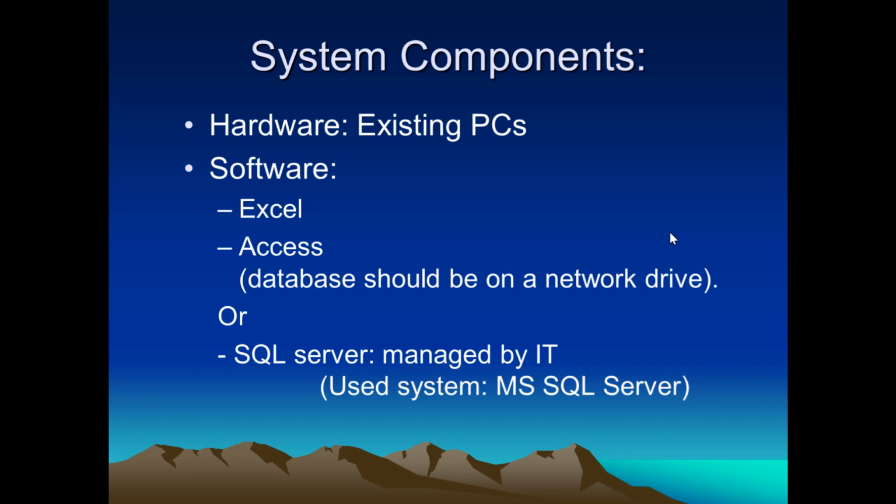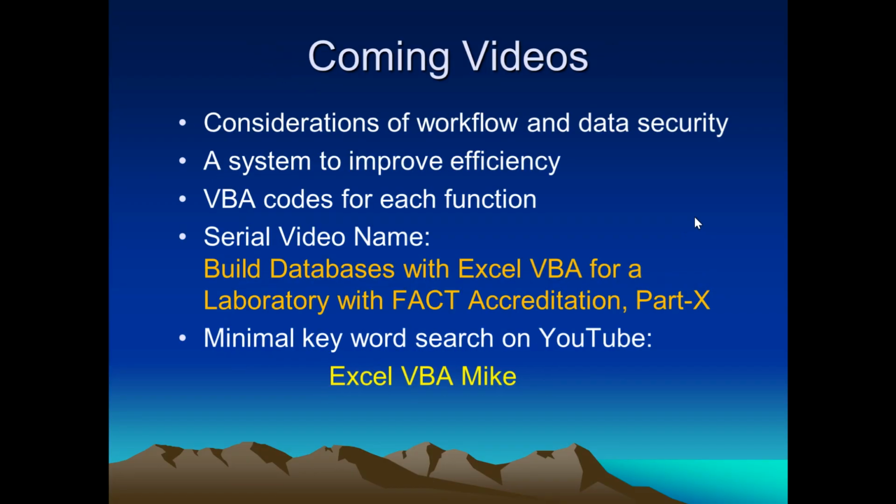Also, it is much faster than a network drive. I have set up the system using Microsoft SQL Server and it works very well, much better than Access. I will show the system one by one.